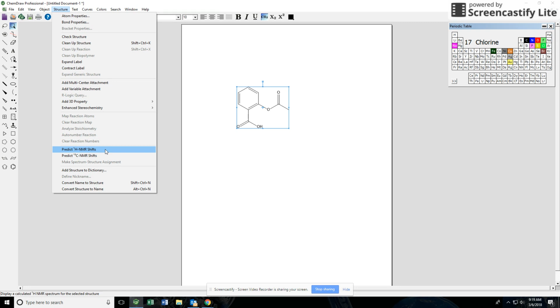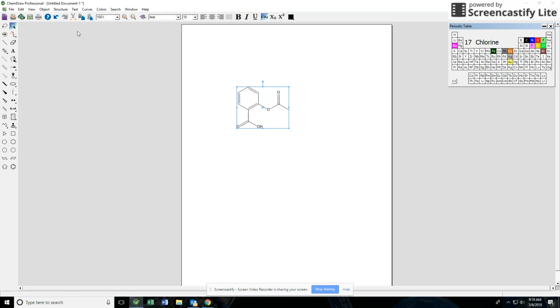And if you're only using this to solve your problems and you don't know how to actually interpret the NMR yourself, you're going to be losing points on the exam. So don't do that. This is here to help you guys out, and to help to understand NMR, which is a very difficult subject, but don't use this exclusively. This is here to help you guys out, not to be a catch-all for everything.